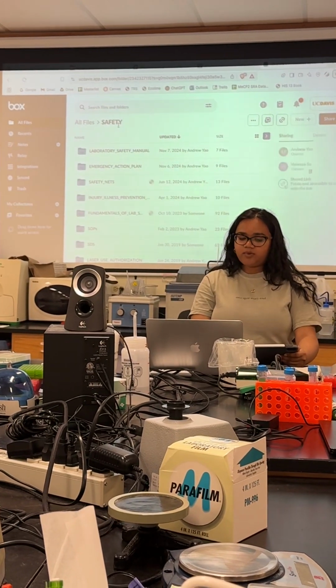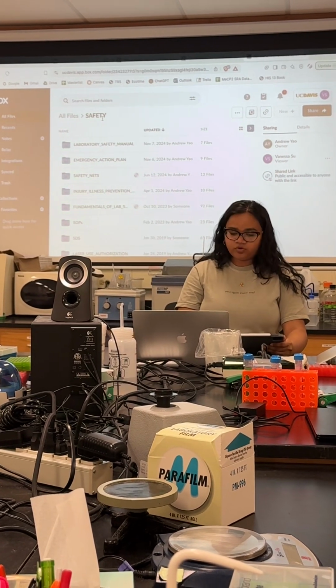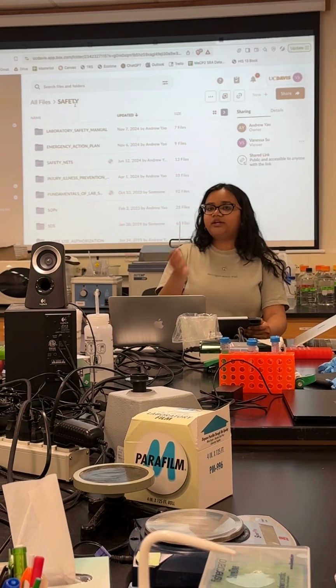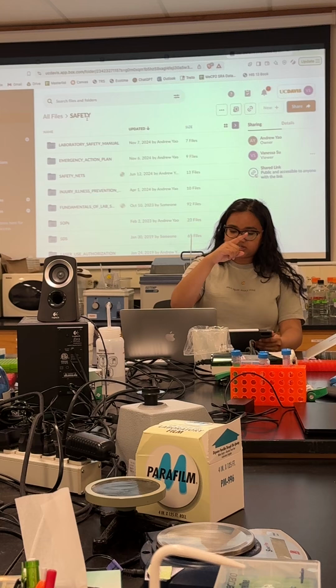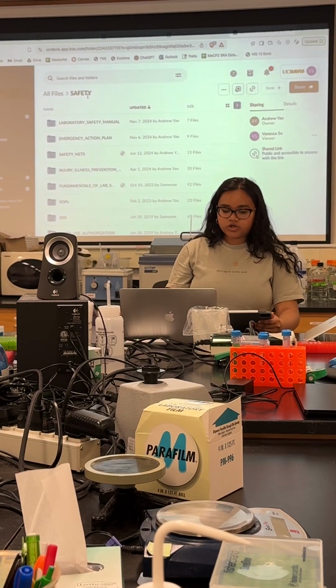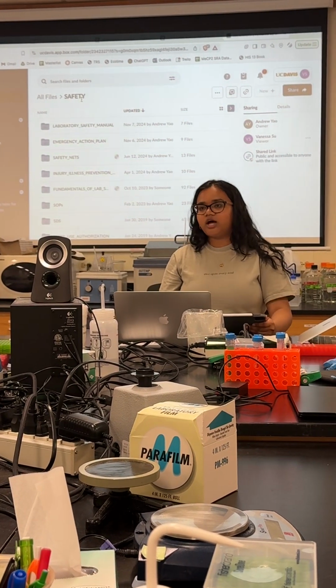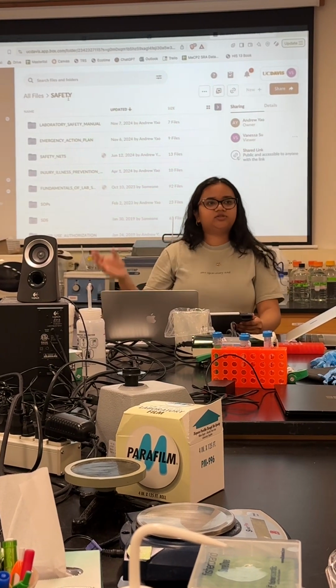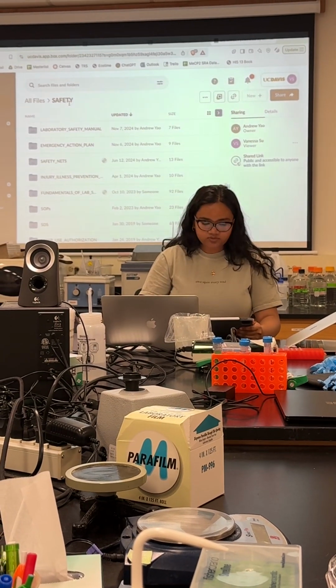We'll also be talking about where fire extinguishers, fire poles are, we just talked about preferred evacuation route, but I'll be pointing out these things as we go outside. And just as a note, this is a student run lab. So we have a rule that no one can be in the lab alone. So that's why we'll be taking roll to make sure everybody is present when we get outside. That's the biggest thing with that.